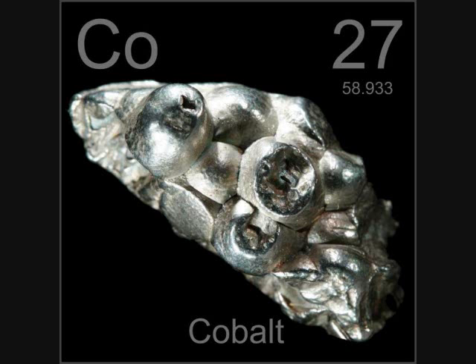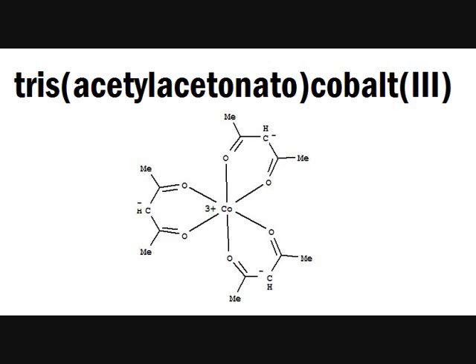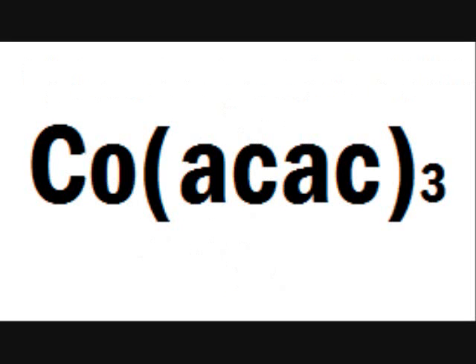The main reason I chose to do a video on cobalt, however, is so I can explain a project I'm working on in my chemistry lab that I find really fascinating. This project involves synthesizing tris-acetylacetonato cobalt-3, and this is one of those rare cases where something is easier done than said. This is why in lab we call it cobalt-3 ACAC.